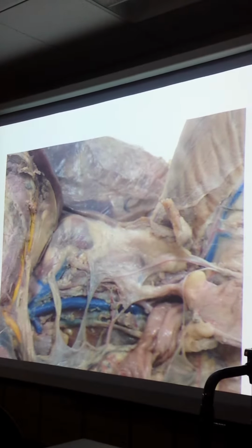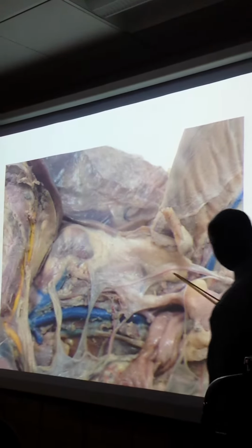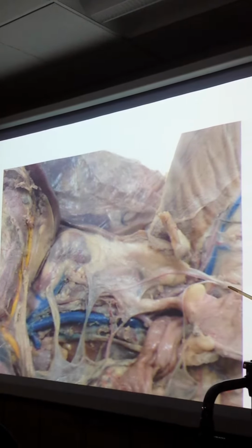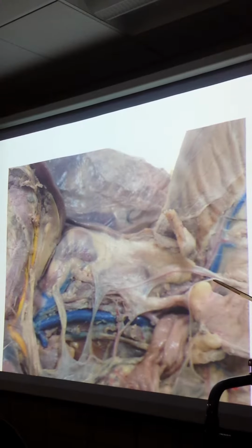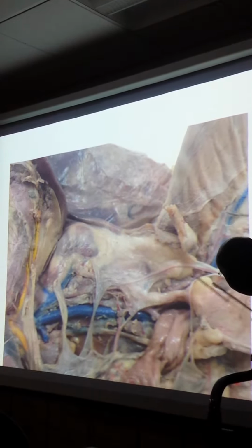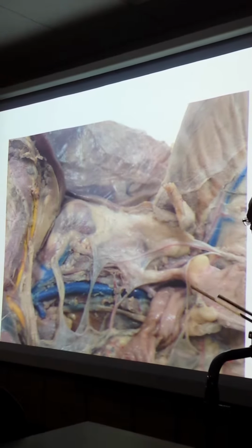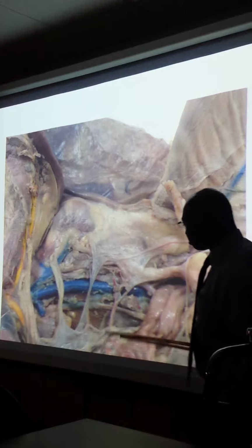All right. So this is more or less the same, really. This is again, you see, this entering the spermatic cord over here. You see that? The internal spermatic artery, and then you can see this is the vas deferens. Okay, the blood is over here. This is kind of not clear, but then I've got better pictures again.